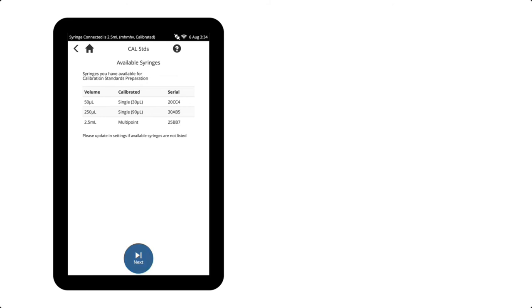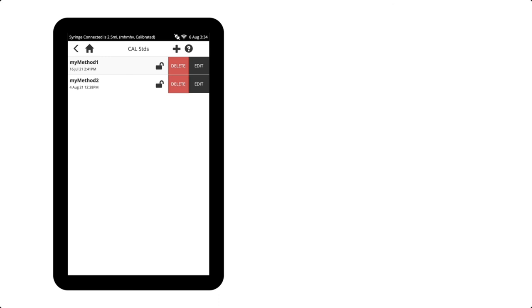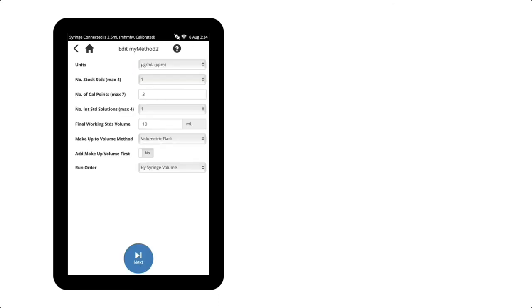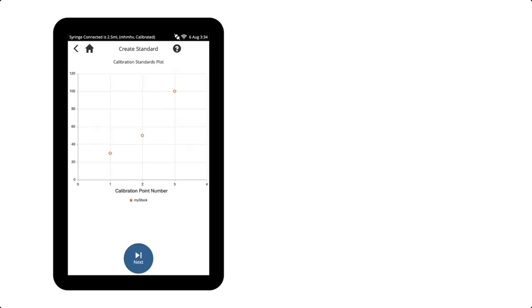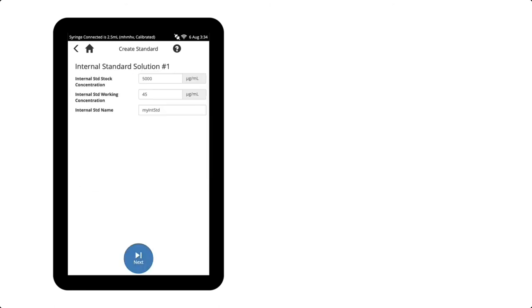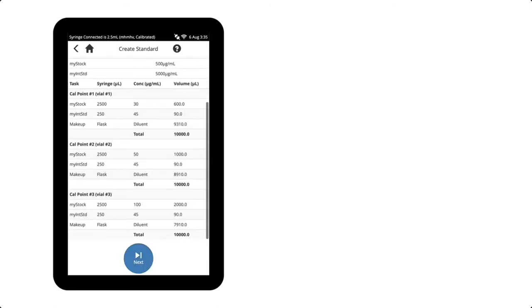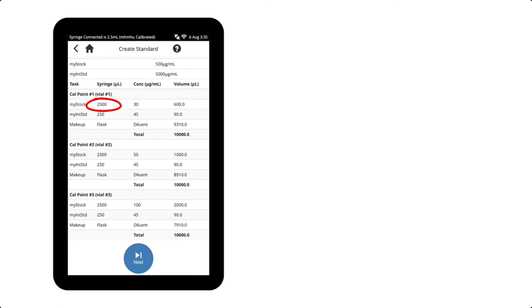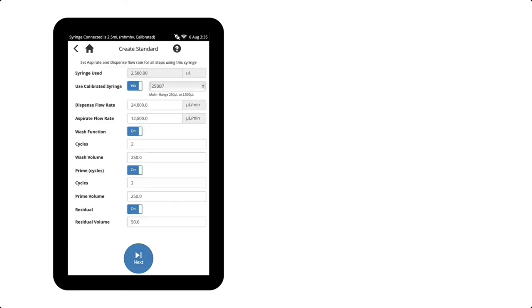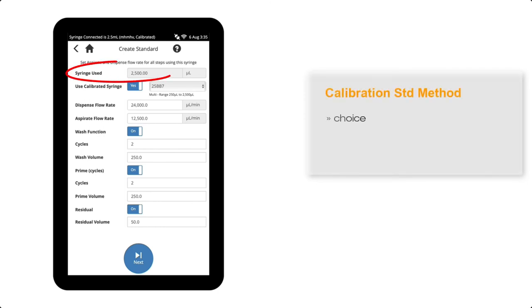I have previously created a method named my method 2, and as I run through the various screens, I can see this method will use a 2.5 mil syringe for the stock standard and will dispense 90 microlitres from a 250 microlitre syringe for the internal standard. The standard will be made up to volume in a 10 mil volumetric flask.